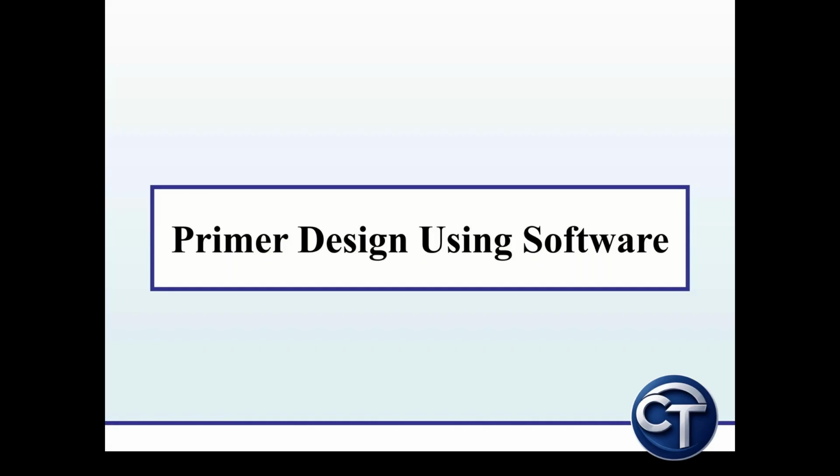Now you have to check the specificity using BLAST. You also have to analyze the secondary structure of those primer pairs. After that, you have to select the best primer pair which shows ideal properties. And in this workflow, each step is essential for ensuring accuracy.